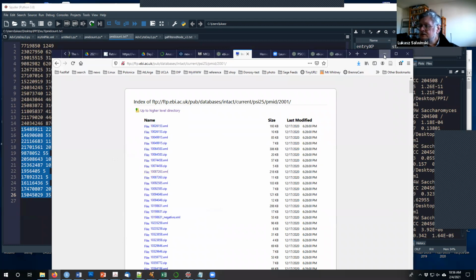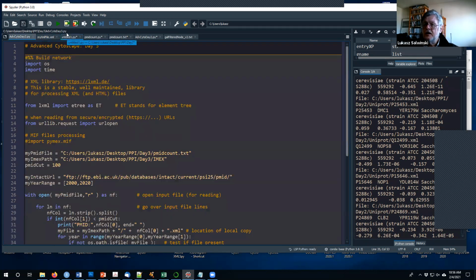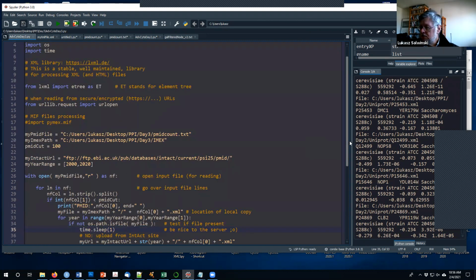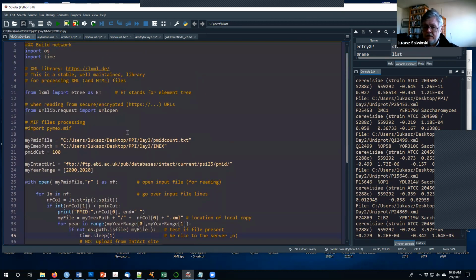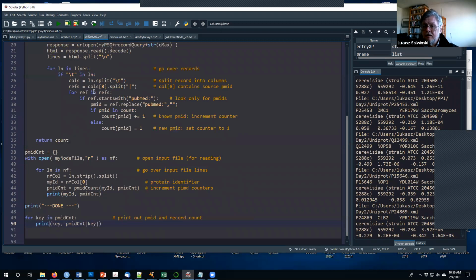Okay, so let's go to our day 3 script. Okay, so here's the script, and let's see what's there. The script is taking as input the file that I've shown you before, this guy, that was generated by the script here.